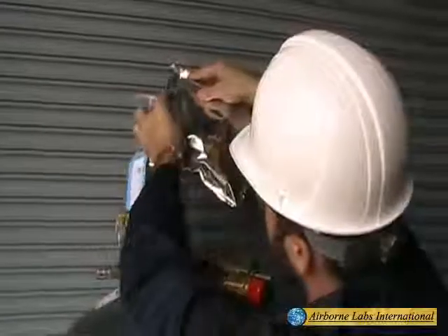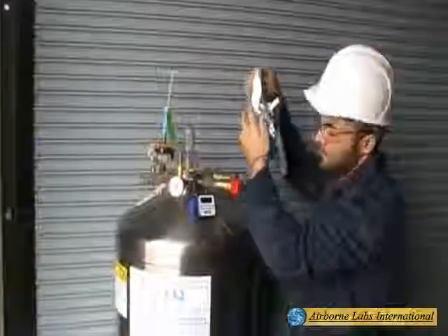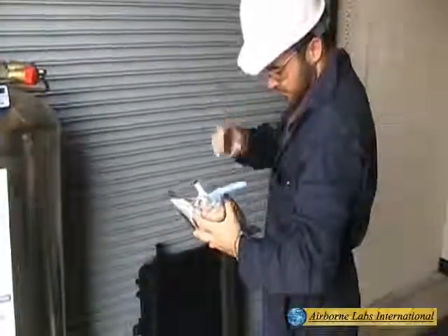Next, holding the lower valve body securely with one hand, use the other hand to close the bag valve knob clockwise until it is snug. Check for leaks by gently squeezing the filled bag. Leaks will be noted by bag deflation.